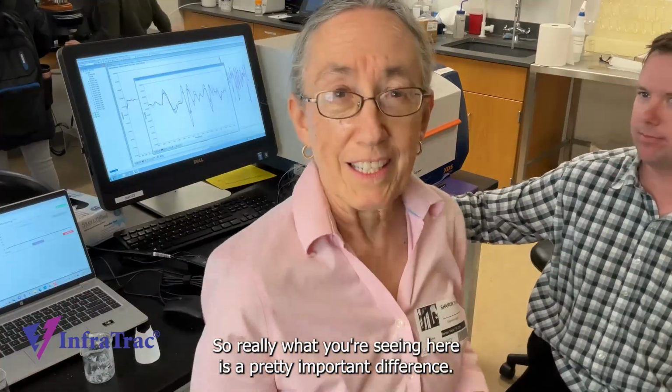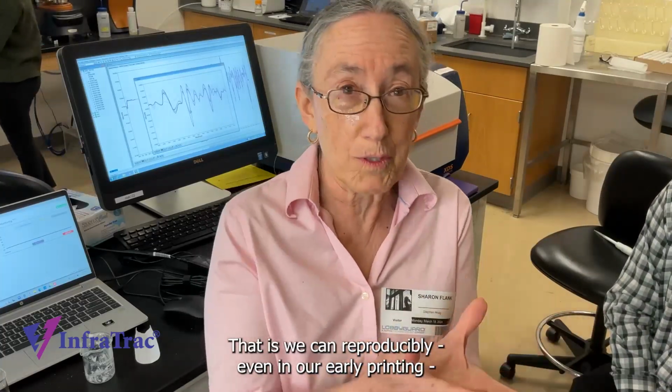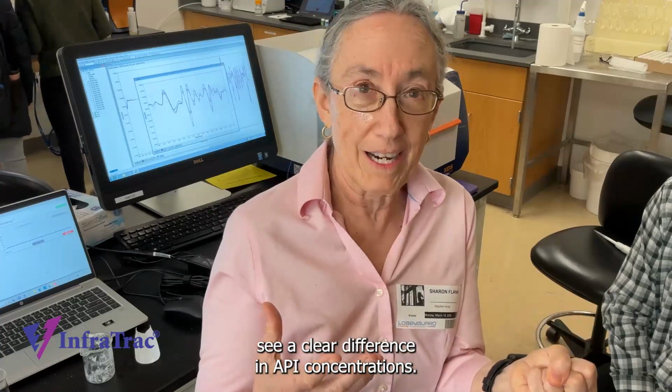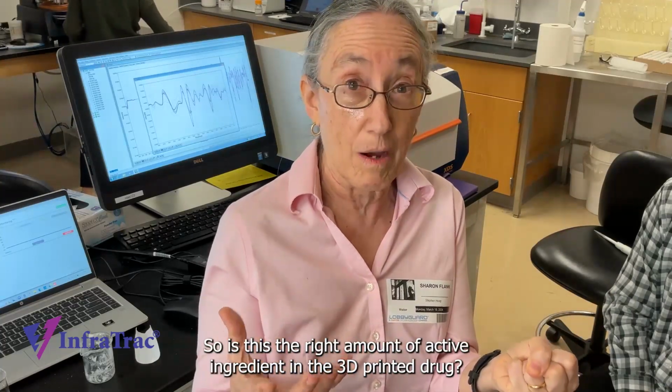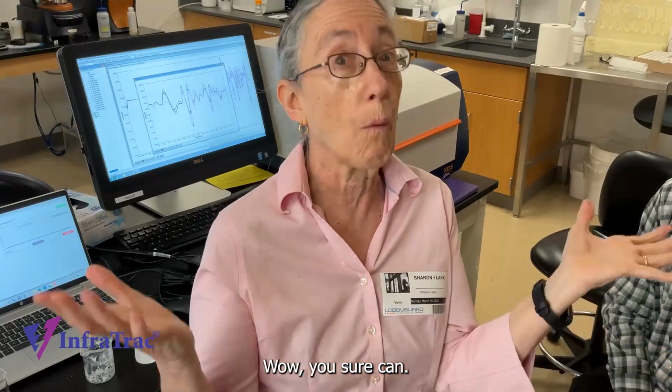So really what you're seeing here is a pretty important difference. That is, we can reproducibly, even in our early printing, see a clear difference in API concentration. So is this the right amount of active ingredient in the 3D printed drug? Can you tell with spectroscopy? Wow, you sure can.